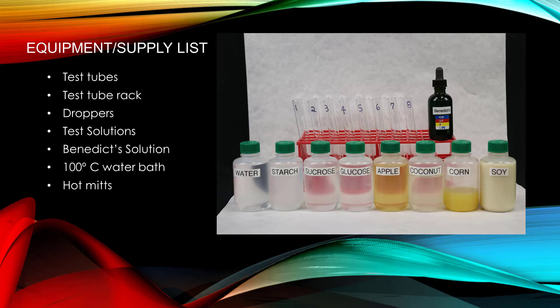Here is the list of items we will use for our experiment: test tubes, test tube rack, droppers, test solutions, Benedict's solution, a 100 degrees Celsius water bath, and hot mitts.